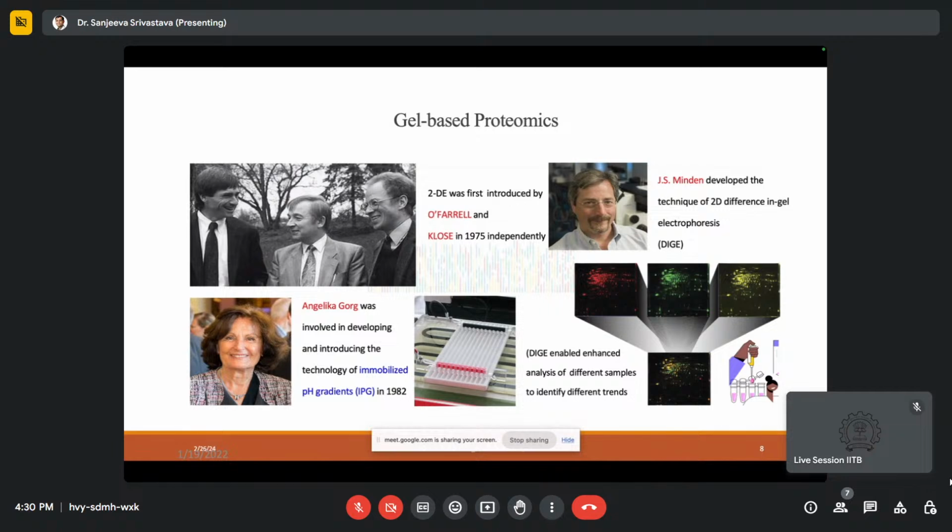Third, you can also utilize what you see here, something like an isoelectric focusing unit. If you want to use it for fractionation of the proteome based on the isoelectric point, you can use the off-gel fractionator, a similar principle, where you take the IPG strip and put it in the IEF field, and you place your protein in solution form, and on top of that you place the plastic cup, and then the proteins will move, and you will get protein separation based on the pI value in the respective cups. So now you can take pH 4 to 4.5 in one fraction and 4.5 to 5 in the next fraction. So now you have again done fractionation by pI value.